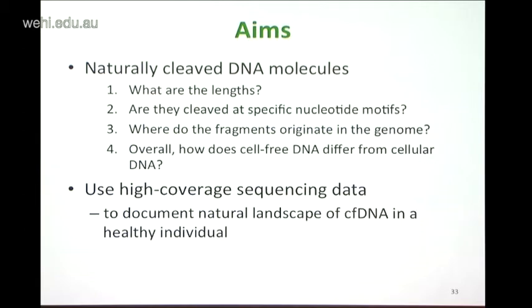So our aim in this section was to find out as much as we could about cell-free DNA features using high coverage data.